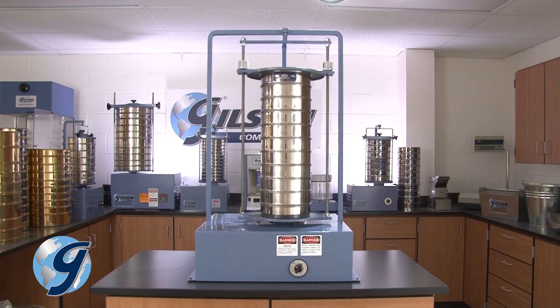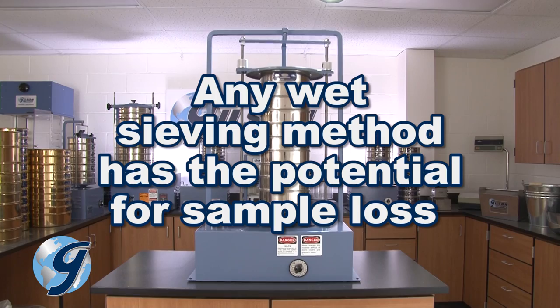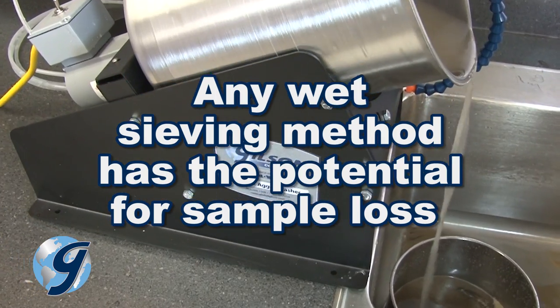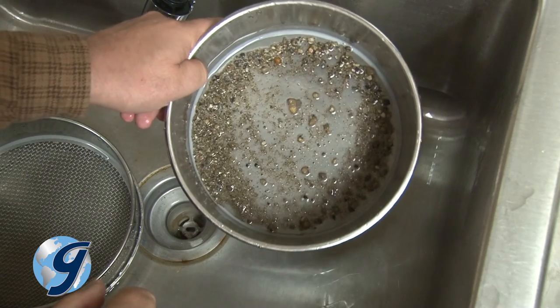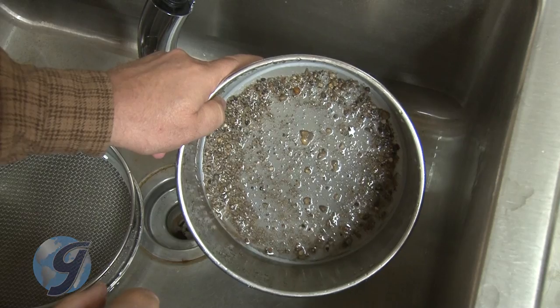It's important to be aware that any wet sieving method has the potential for sample loss. Some material may be washed away during agitation or decanting, or may be forced into the crevices of the sieve and become trapped.